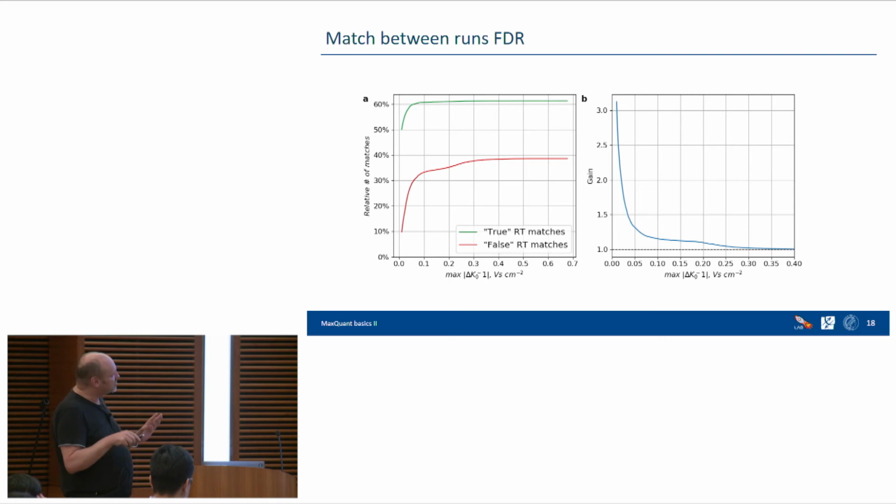And on the x-axis we change the ion mobility window. So it's 0 here, so big here. So if you come from here to here, the ion mobility window is getting smaller and smaller, basically. So it should be more and more specific match, right? And so on the right side, you don't have any constraints. So you don't constrain on the retention time and also not on the ion mobility, right?